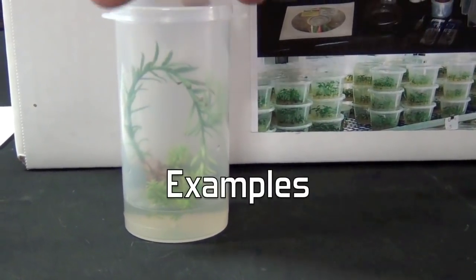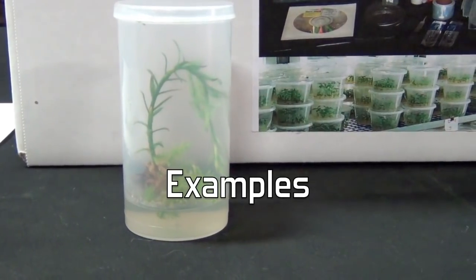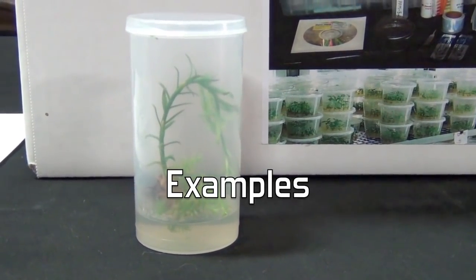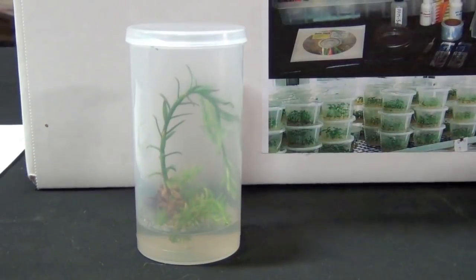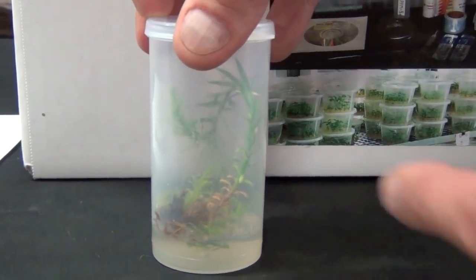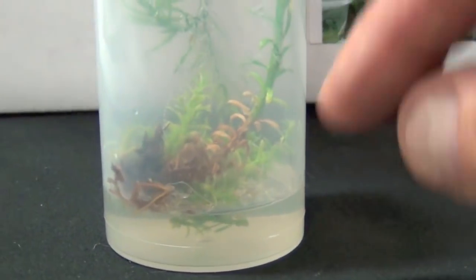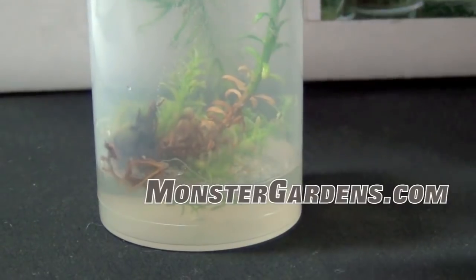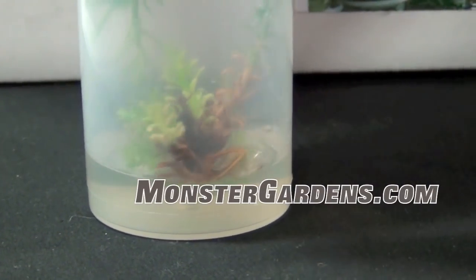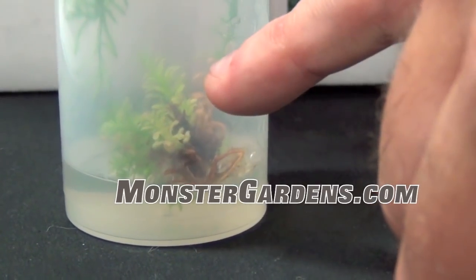Redwood is really one of the easiest plants to put in culture. You think that redwood grows from burl, and what we're really doing is we're culturing burl. That little lump down there at the bottom started as a piece of redwood leaf. I started with a tip like that, and then as it got bigger down at the bottom it got burl-like, and you can see the new plants coming out of it. There's a small new plant in the center.